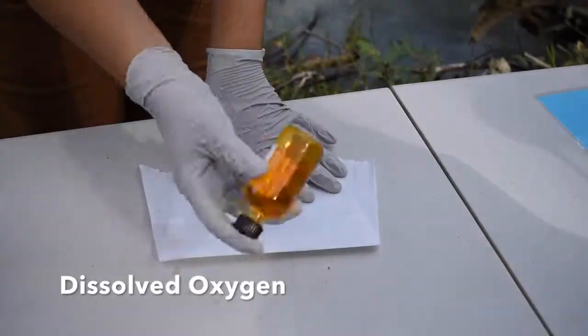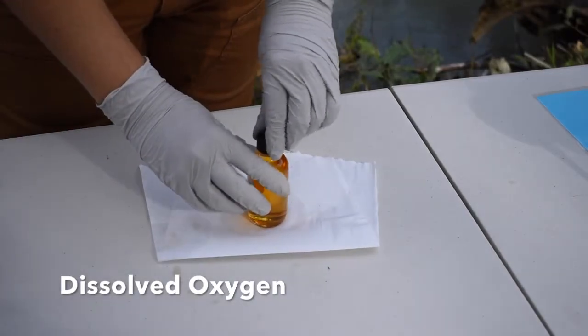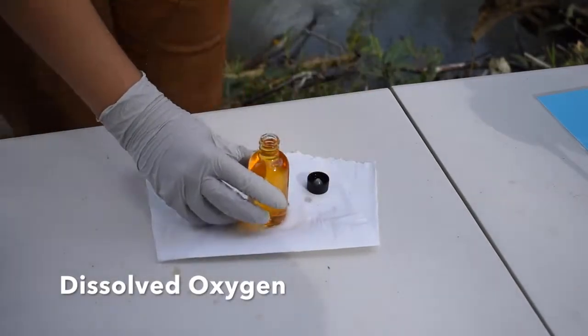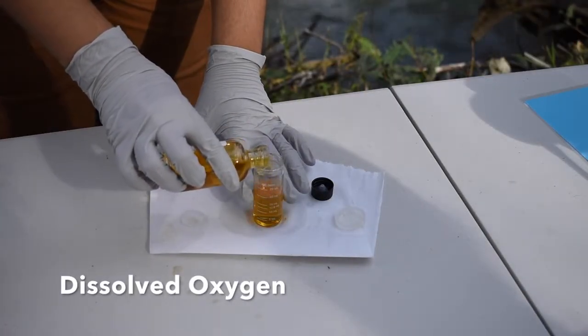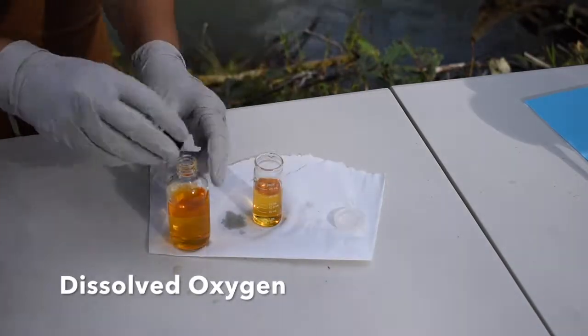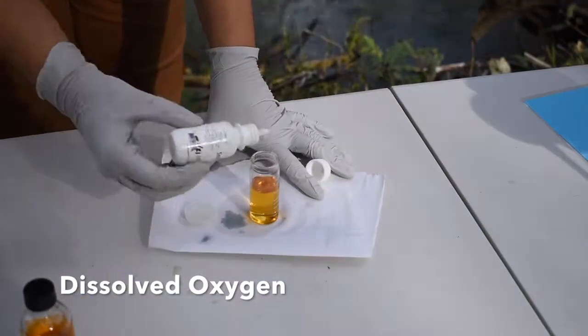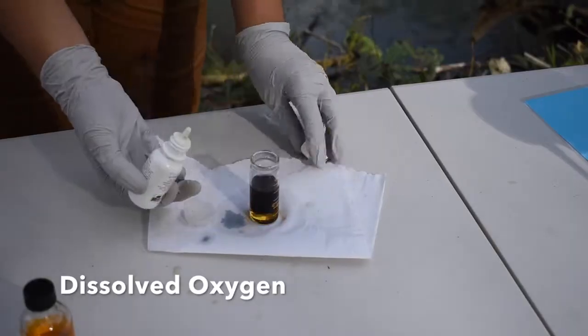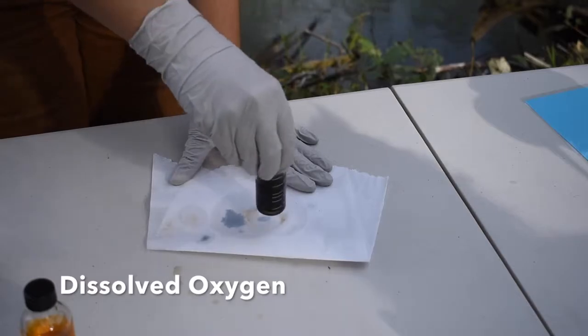Next, we are going to invert to mix until all of the precipitate has dissolved. Then we will open our sample bottle and fill our B bottle with 20 milliliters of sample. Next, we will add 8 drops of chemical number 4, starch indicator solution, cap the bottle, and swirl to mix.